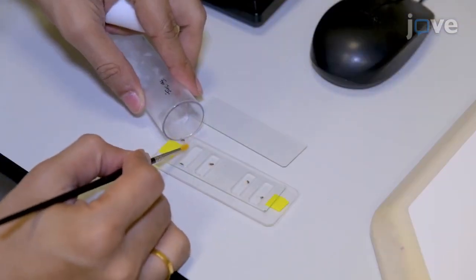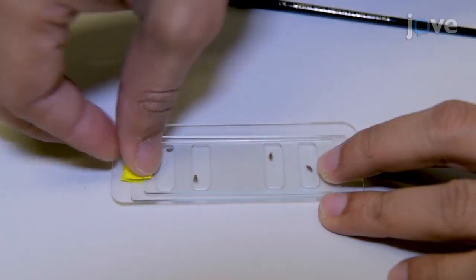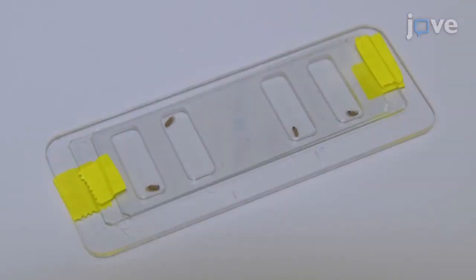Using a clean brush, transfer one anesthetized fly into the chamber and secure the chamber with a second slide and tape. Then allow the chambered fly to acclimate at room temperature for 15 to 20 minutes.